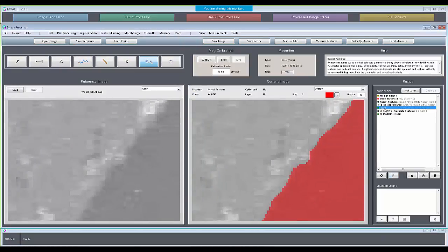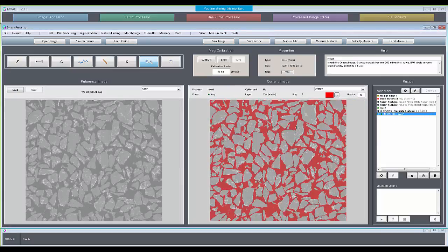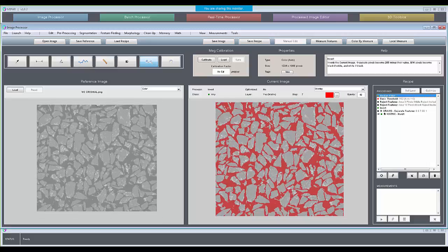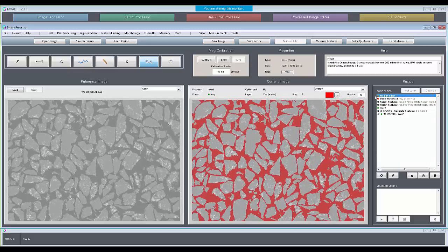And then we still need to invert, we still need to separate, and then we invert again to have the cleaned matrix selection. So that's how you can test. You can put some pre-processing up before you threshold, and then see if you still need as much of the noise cleaning as you thought that you did. But that's a very valid question.